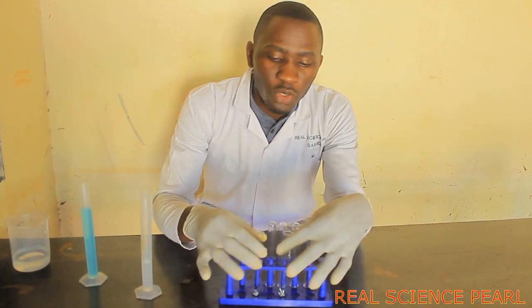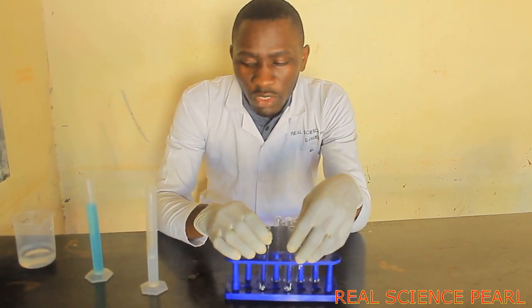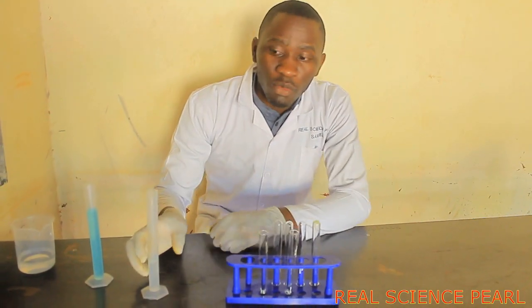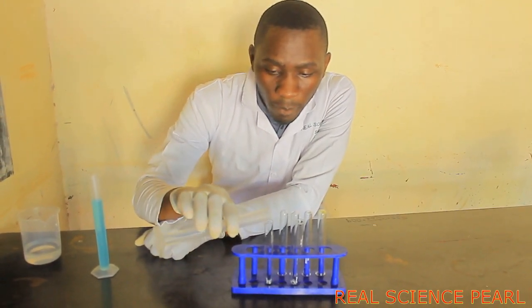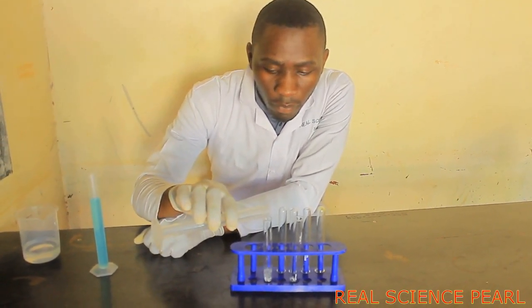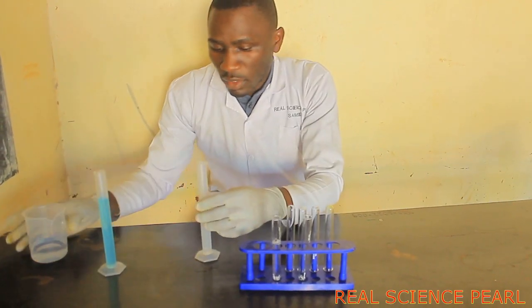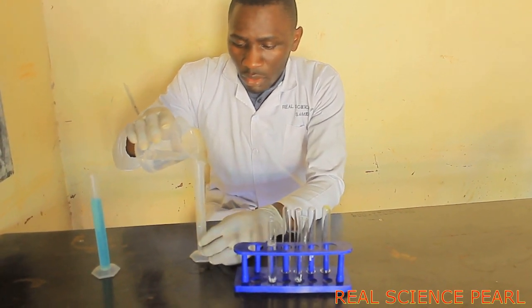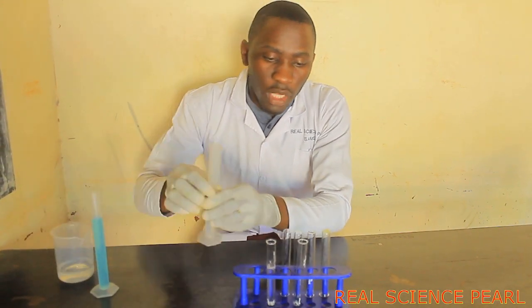Now, today we are going to use zinc granules. I'm having the same quantity of zinc granules, and what I'm going to do, I'm going to add the same volume of hydrochloric acid. I'm going to add 10 ml here. Yes, add 10 ml. Then I also add 10 ml.